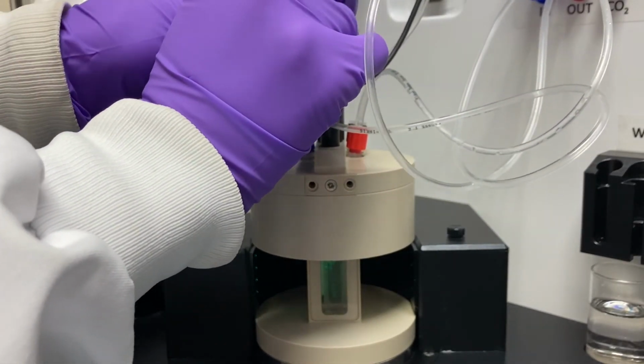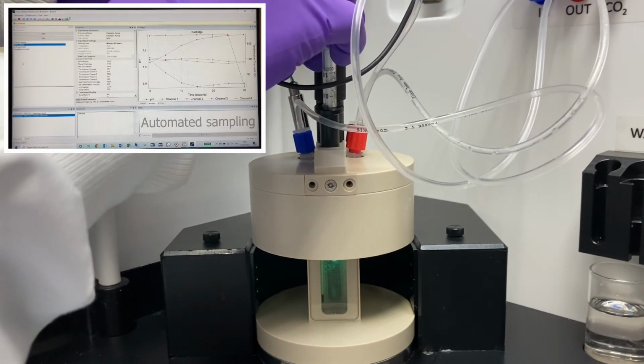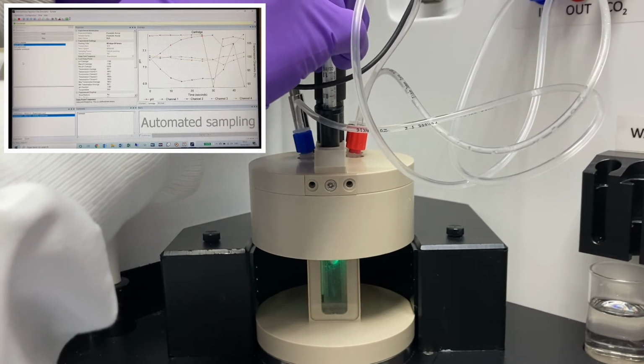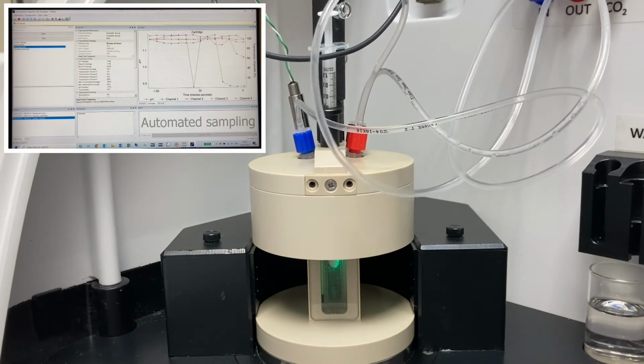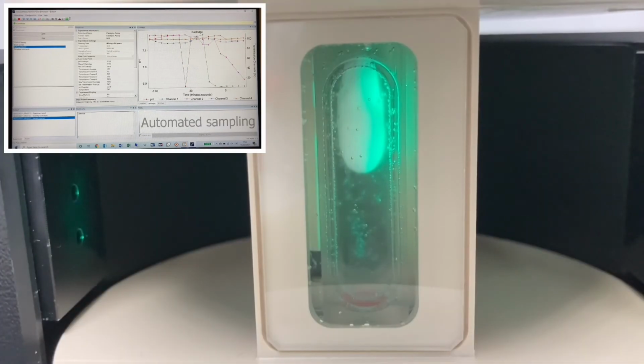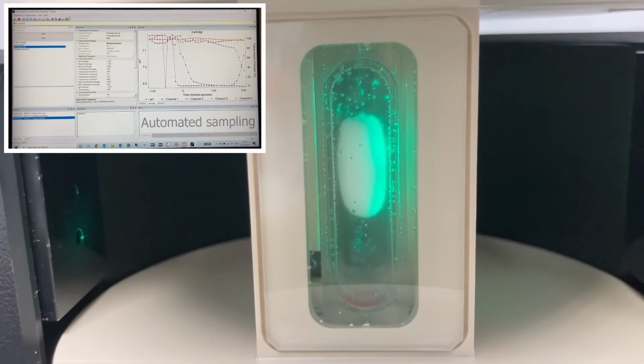Once the formulation is injected, if there is any precipitation or the formulation is a suspension, for example, this will alter the light pathway between the LEDs and the diodes, causing transmission to decrease. In this example, the formulation is opaque, and we are looking at 4 LED channels individually. Upon injection, the depot blocks channels 1 and 2, seen in green and pink on the graph, causing a decrease in transmission. As the depot starts to migrate away from the injection site, channel 1 in green is no longer obscured and starts to increase once more, whereas channel 3 in purple starts to become obscured.